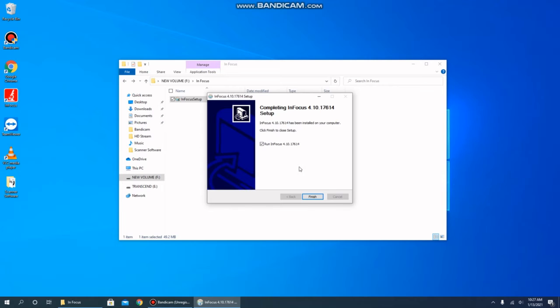When the software is fully installed, you will notice that an InFocus icon appears on your desktop and we're ready to go. At this time, it's important to make sure that the camera is powered on and connected to your computer via the USB 3 port.